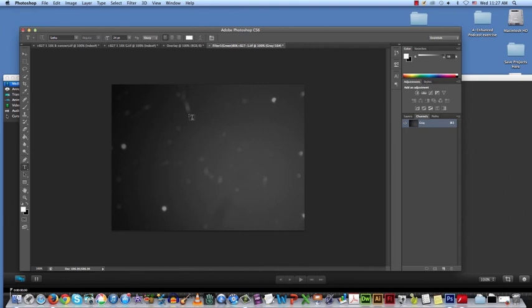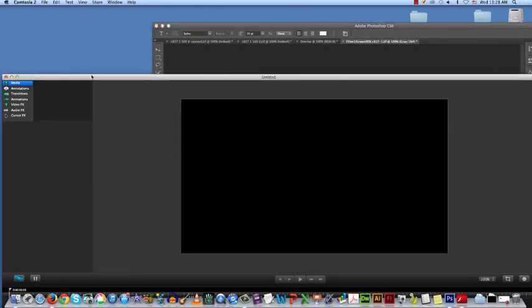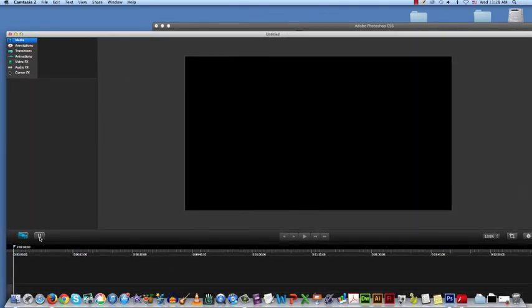Now, this image was not taken in focus, and so that's a different problem. But don't worry if the images that you open show up as black initially. You can find the signal that was there when you actually took the picture. All right, so you need to do all that with all your images, and then you can start analyzing your data.